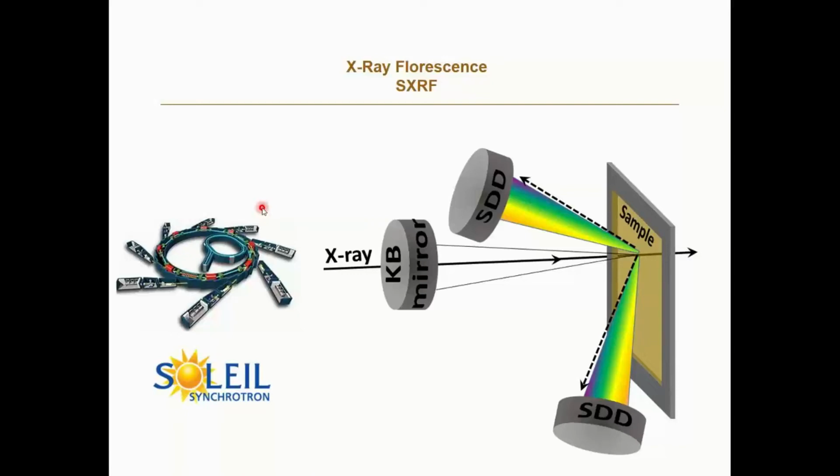However, what was interesting, we observed that O-PTIR is much less substrate sensitive, and measuring samples in reflection mode, we can use different sample substrates. That gave the idea to correlate O-PTIR measurements with X-ray fluorescence measurements.